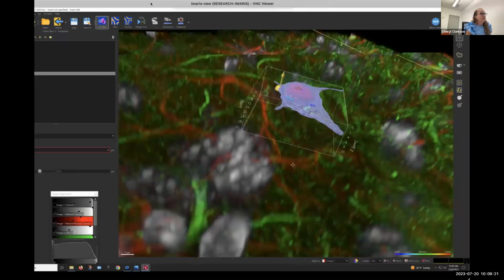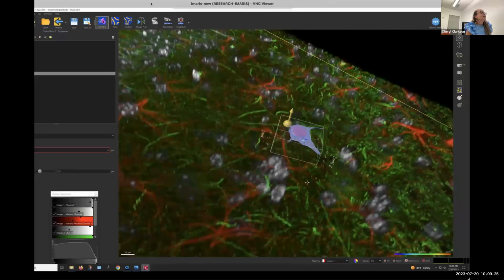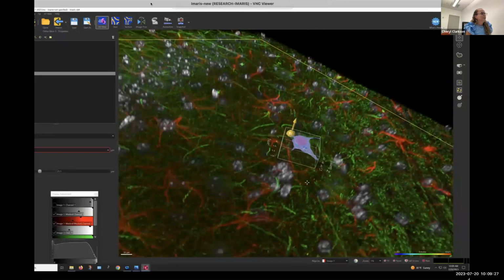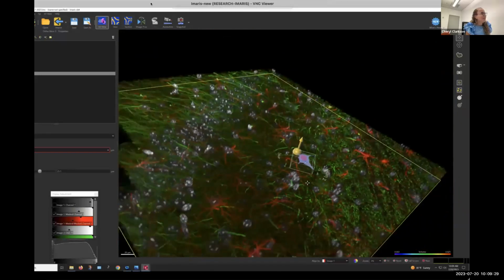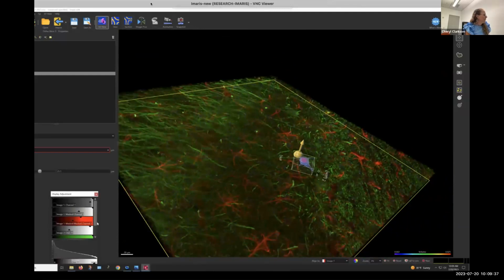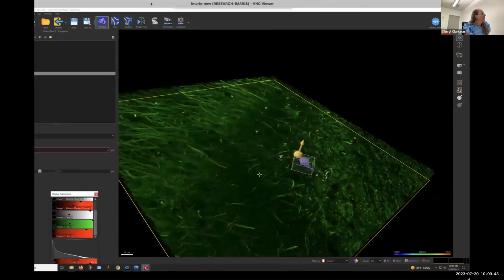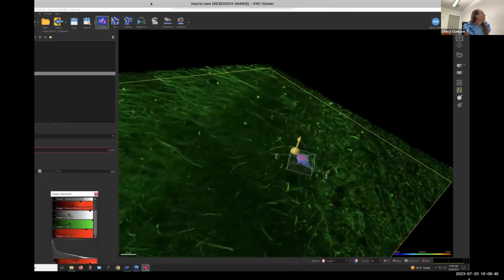So I just want you to be able to see a little bit. It's very hard, that's what I'm talking about, fiducial points, when you are entering all this ocean of different types of cells and different types of structures, as you can see here. So let's put this one on, and you can see it all the time.